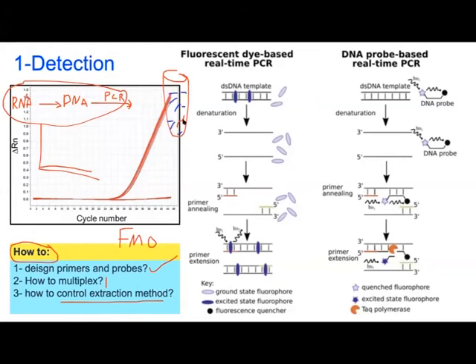But there is only one RNA molecule, for example, from the virus. So in this assay, you also need to design primers that target a human RNA molecule. If the human RNA target is working and the viral RNA target is not working, then you can assure that this patient is negative. Because if the human RNA target is working, it means your extraction was good, your reverse transcription was good, and your PCR was working. So this will give you an assurance.